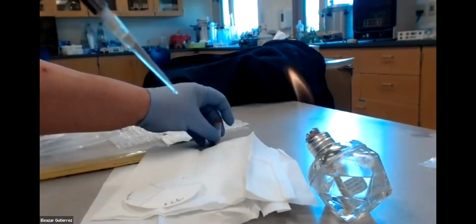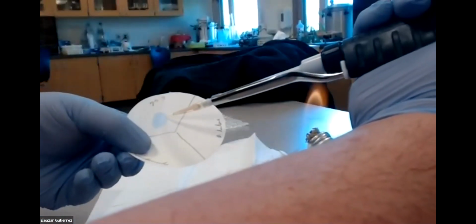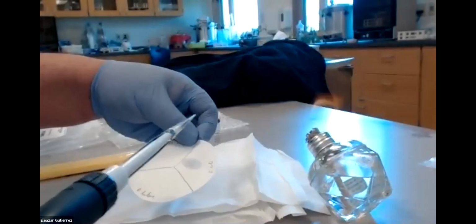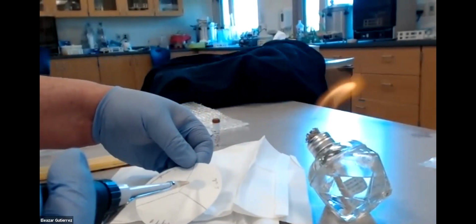I'm going to put it on my E. coli, just like so. Oops, you guys can't see, can you? Just like so. Okay. You gotta have a timer, and we wait.